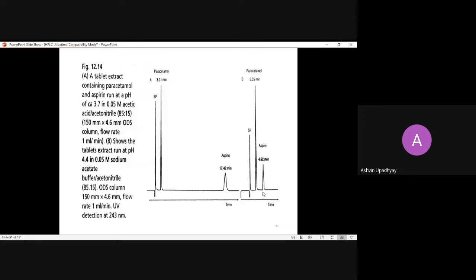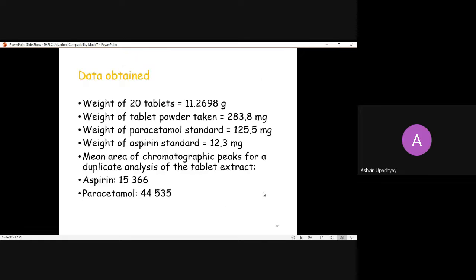So this is the methodology where you have to take some modification, the consideration of the pK value, the consideration of the polarity for the proper utilization of the HPLC system. Because the HPLC system where you are working, you cannot keep it idle or utilize it very haphazardly. You have to pinpoint the utilization with the optimization of your method, your mobile phase, choosing the right column, the right pK value, mobile phase, the polarity, all aspects you have to consider in your mind for the optimum and proper utilization.